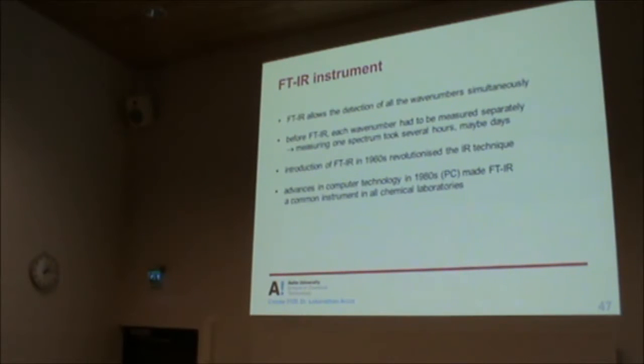That's why it's called FTIR. If you observe, a lot of people in books no longer call it just infrared spectroscopy, they call it FTIR. FTIR allows detection of all wavelengths simultaneously.